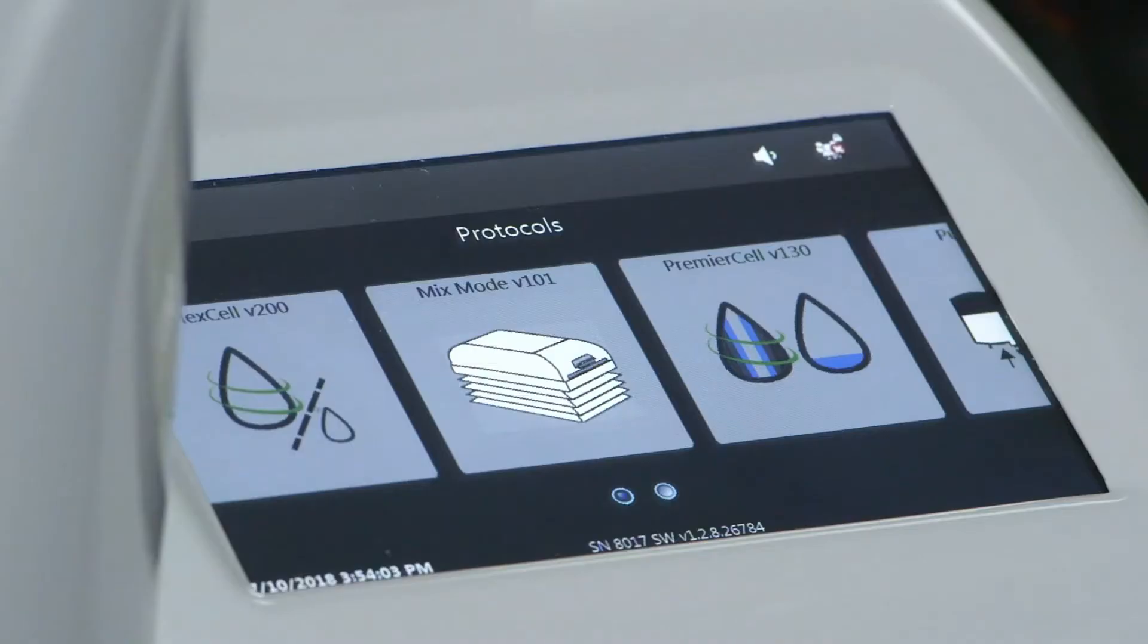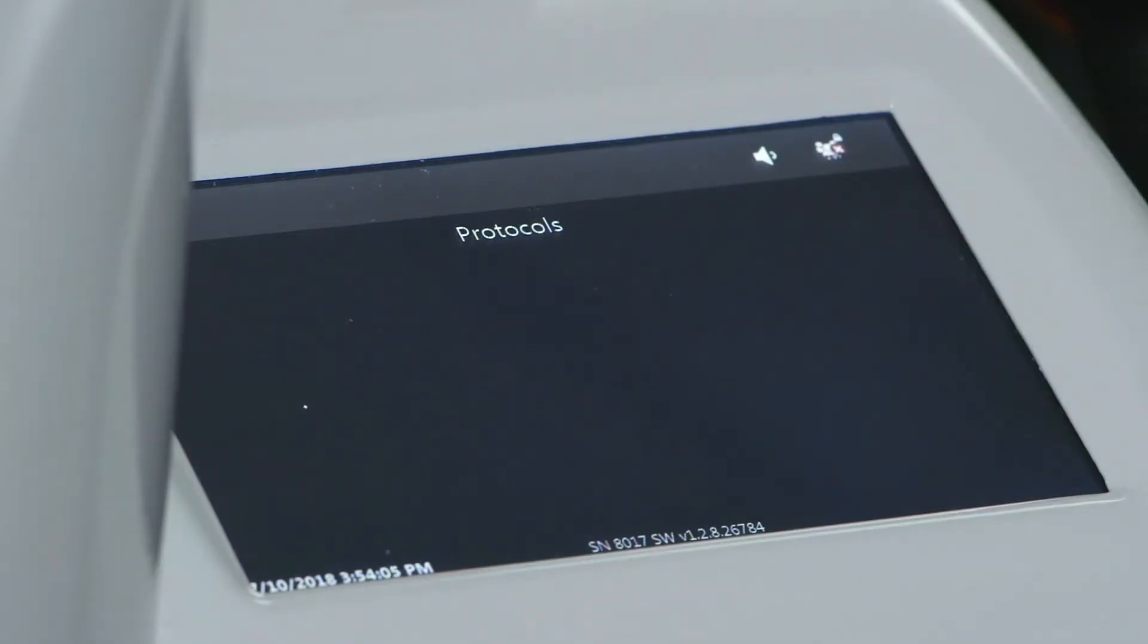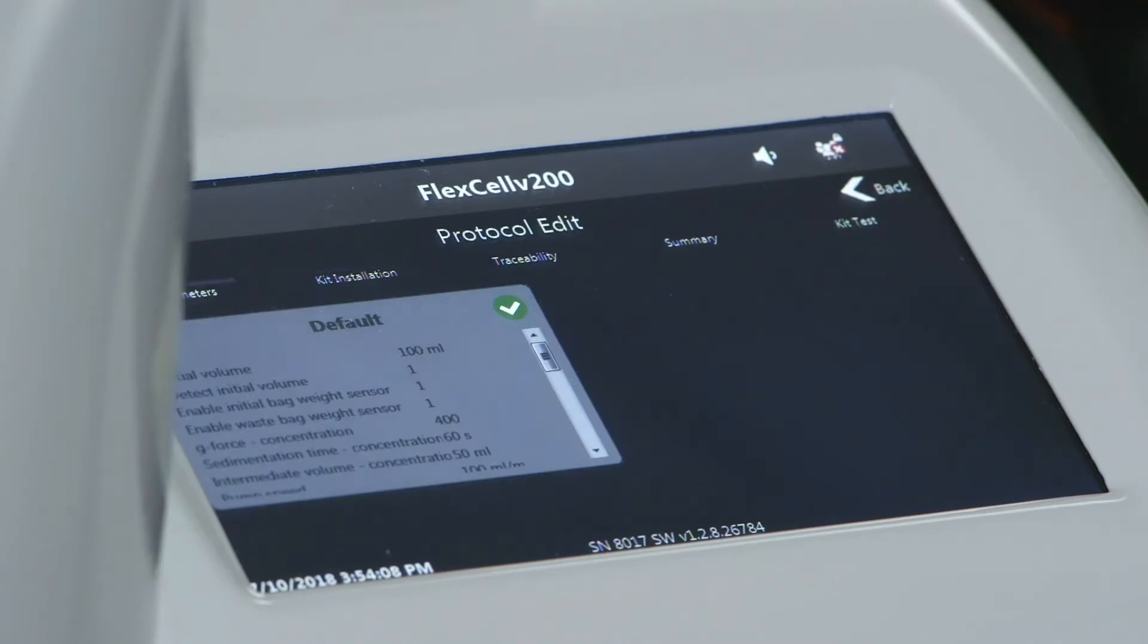For our purposes today, we'll run the Flexcel protocol, dedicated to harvest and final formulations. From here, you can access the various sections and follow the instructions on the screen to proceed. Review the process parameters and follow the on-screen prompts.